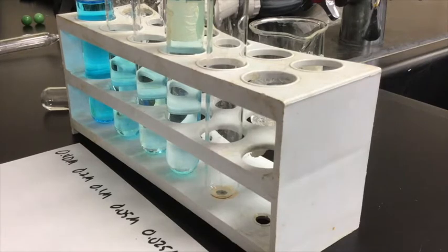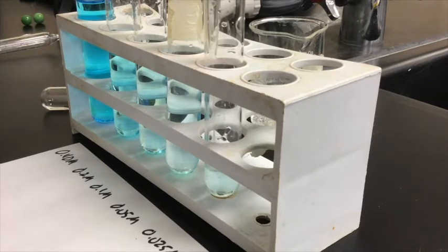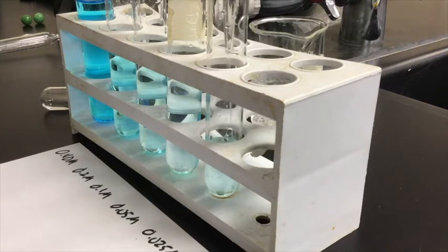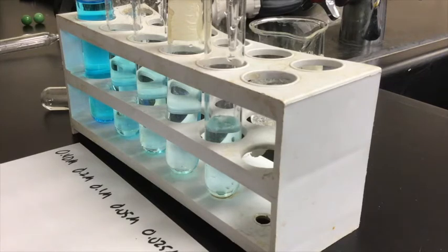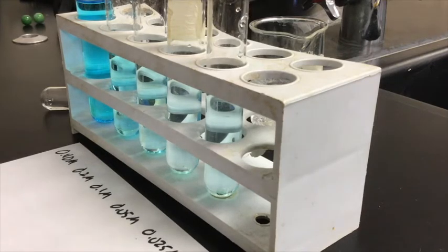Take 10 of the 0.05, put it in here, my last one, and then add 10 more of water, and shake that guy up.